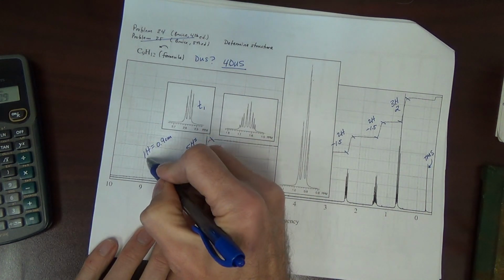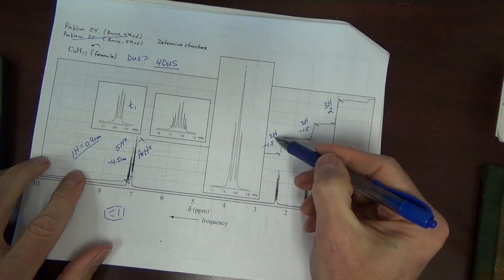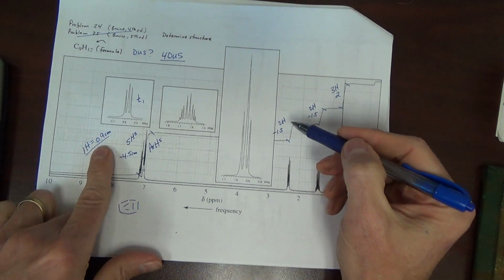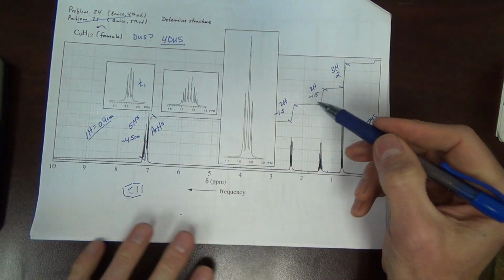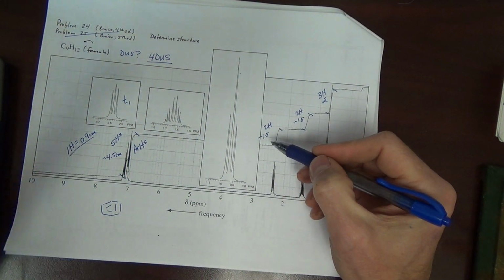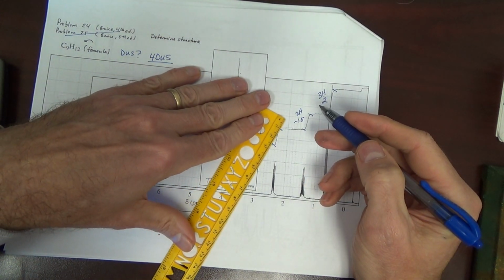Okay. Does this hold consistent across? If we're saying this is 2H, then it should be 1.8 centimeter. Well, it's close. I said 1.5. Okay. We can measure again.